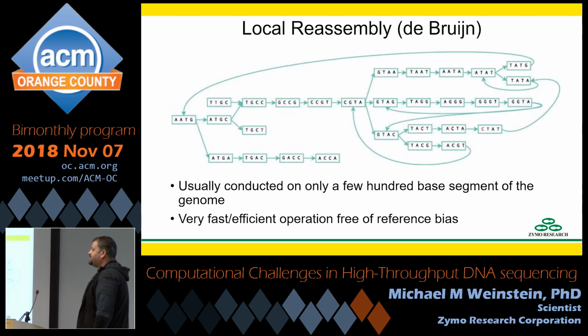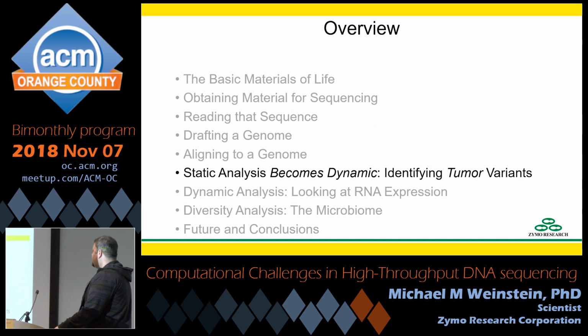The ultimate solution to this is take that region where we know we have an insertion or deletion and actually do a local rebuild on the genome there. We're just going to say to ourselves, I know this person's genome doesn't look like reference here. I'm going to take all the reads from this region and just do a very small De Bruijn reassembly and build them their own custom personal genome here and see what that looks like. This is done on a much smaller scale, so it's a lot faster. And it frees you from any reference bias.